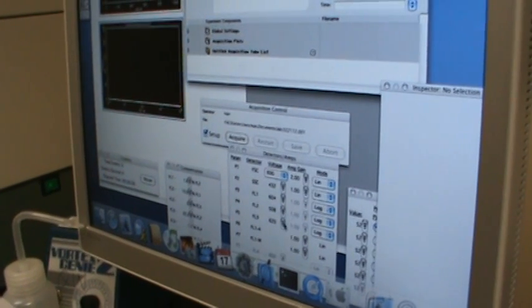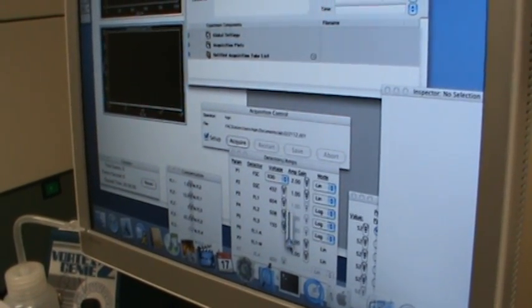So this looks like what you may have gotten. Let's see your printout. So these numbers are the same, but you say you've never done this experiment before. Okay. The first thing is, if we're not going to be running the FL3 channel, take it all the way down. What's the point? You're not even looking at the FL3 channel, okay? But you said that there is some overlap between FL1 and FL2. Yeah, that probably. We'll see what happens. Okay. So we can just start with this.